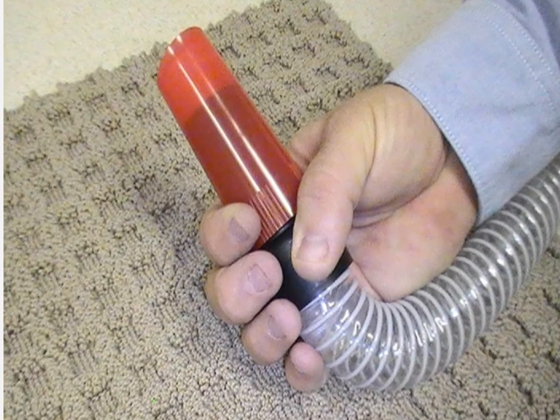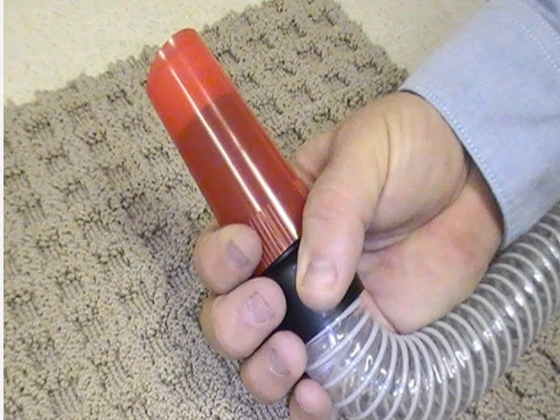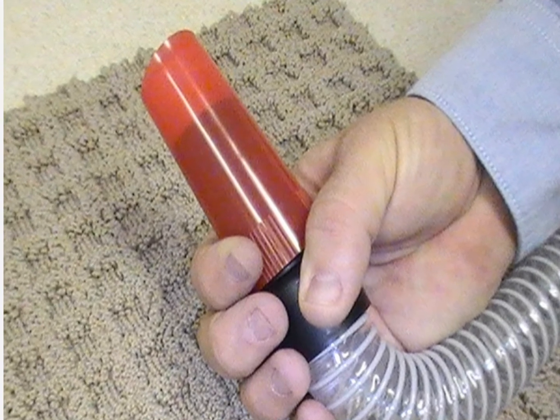Upon completion of vacuuming the sample area, turn the allergen cartridge upright and then turn the vacuum off. This prevents sample material from falling out of the collector.